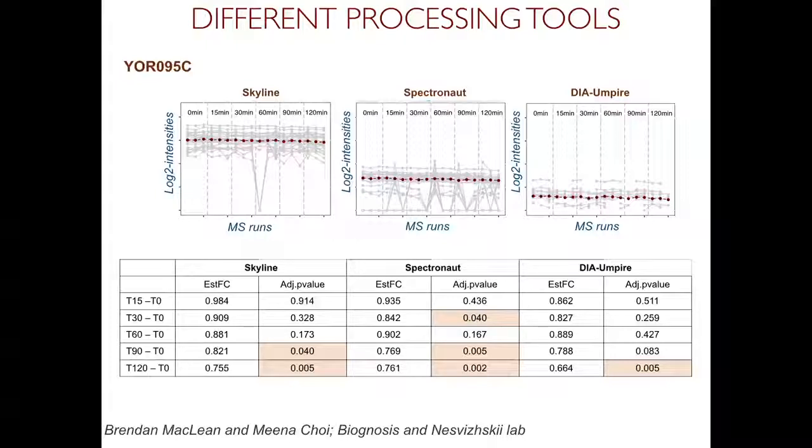And again, we can look into different proteins. So this is the same protein which was not changing at this time point. We were looking at it earlier. So Skyline has just this interference after filtering. Spectronaut, I'm not quite sure which filtering they used. They didn't, so this processing did not rely on these extra runs, right? So without that, clearly we have some noise.